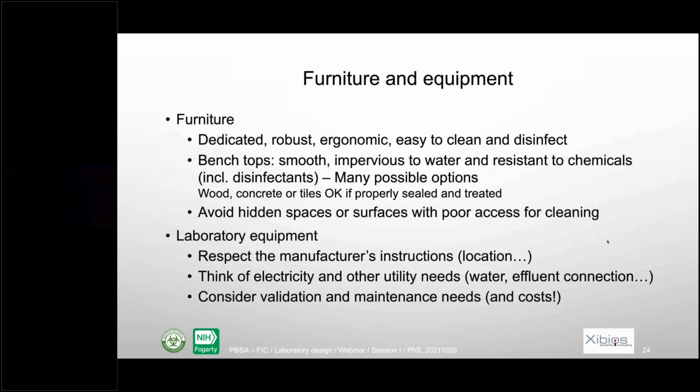Furniture and equipment, again, first they need to be dedicated. You should not use a wooden table from a kitchen, for instance. They need to be robust, ergonomic, and so on. And the bench top should be resistant to water and to chemicals, and of course also be easy to disinfect. Wood, concrete, or even tiles are okay if, again, they are properly sealed or treated.